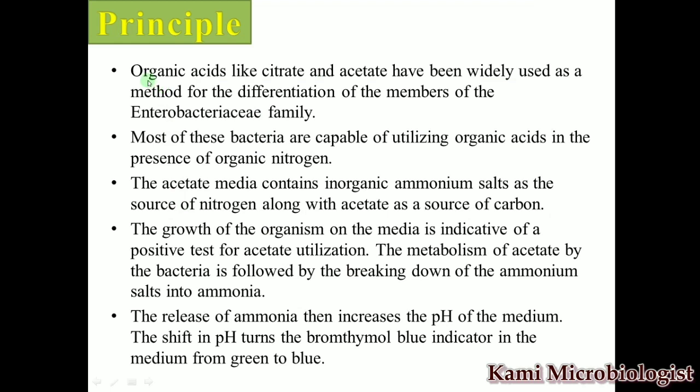Let's see the principle, how this test works. As we talked, in this test we have acetate. Just like citrate, the acetate is used by the bacteria, due to which we can easily differentiate the members of the Enterobacteriaceae family.